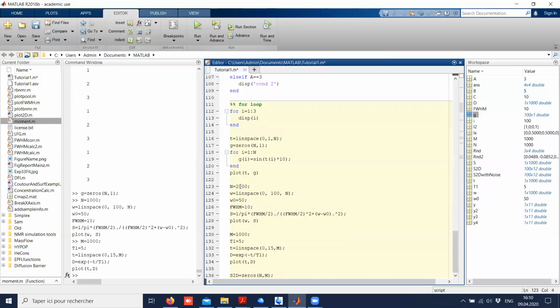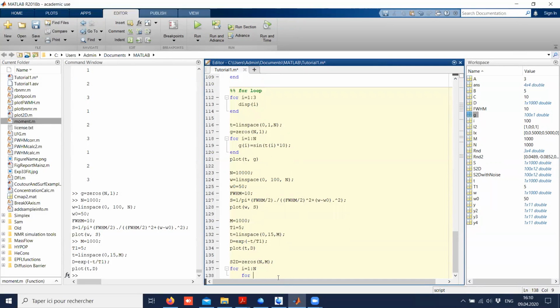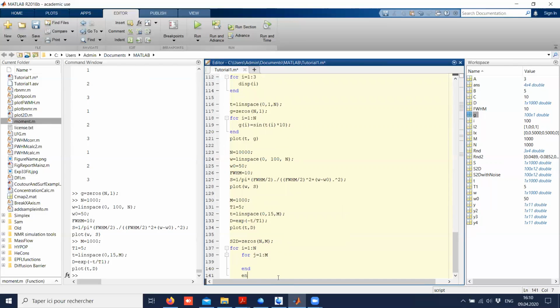Let's increase it to even more like this. So there's no reason why I wouldn't be able to make my calculations like this. It's in a loop, and now I'm gonna calculate this element. Oops. Using, so this was my, let's make it easy like this.